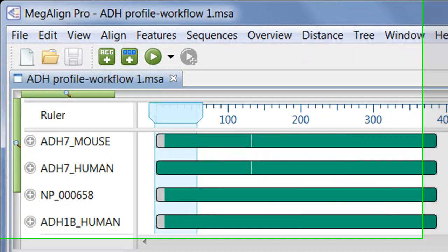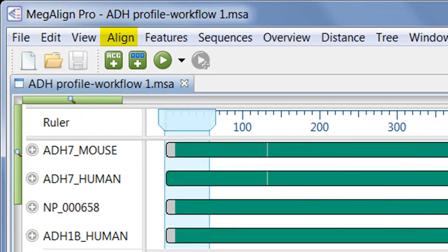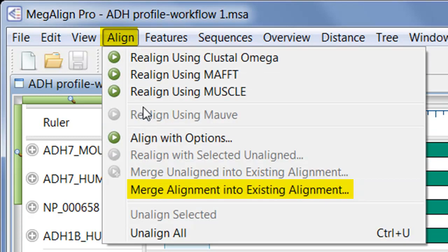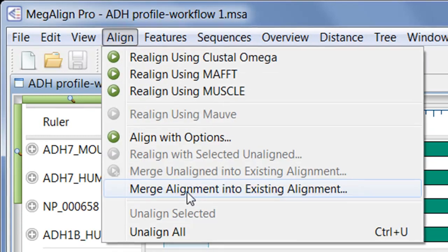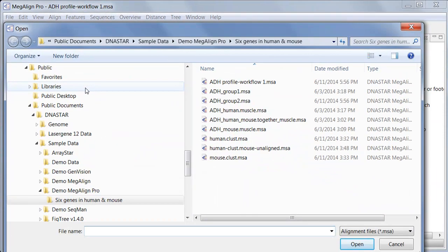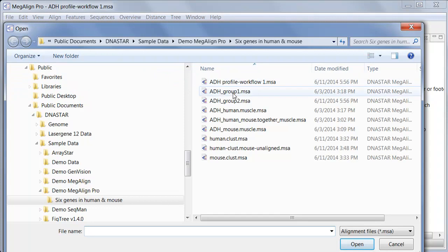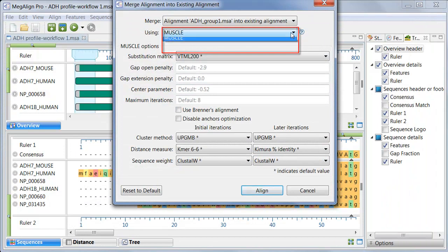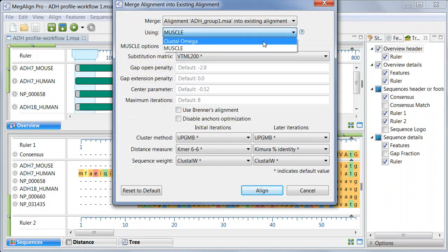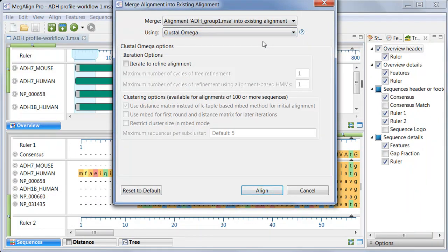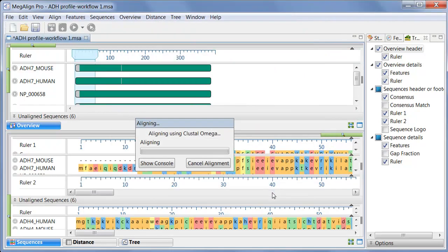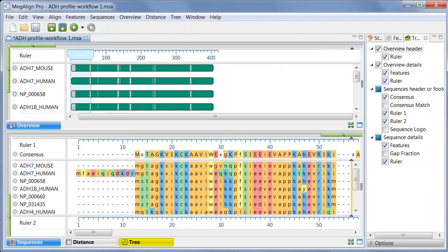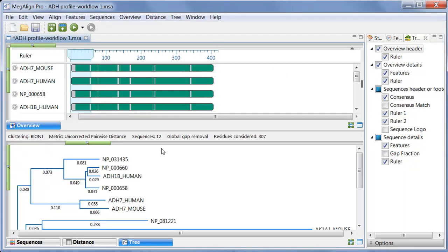To do the merge, I just need to select Align, Merge Alignment into existing alignment. Then I'll navigate to the saved project, which was this one, and click Open. And finally, I will choose Clustal Omega, and press Align. And here is the resulting phylogenetic tree.